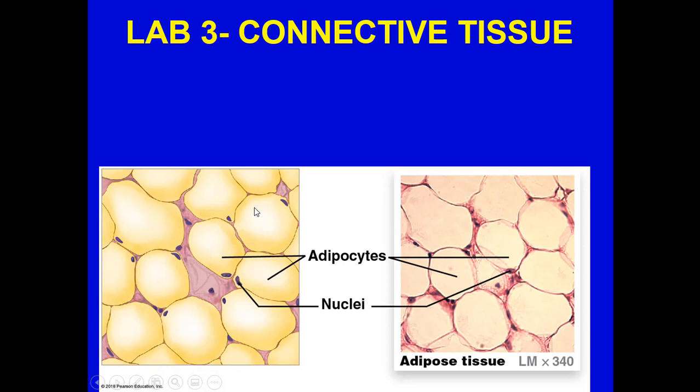And as you can see here, here's your adipocytes here, and here are the nuclei. So you're going to see them here, and you'll see this here, and here, etc.